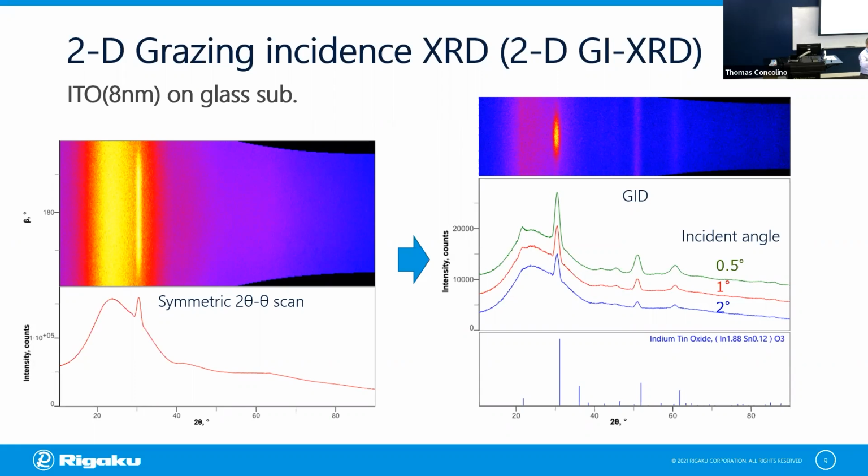Because the 2D detector doesn't have any collimating devices between the sample and the surface, all the X-ray from the sample is hitting the detector surface. If the footprint of the beam is big, the diffracted profile becomes broad as well. So that's why we have to have a very small footprint on the sample surface to get a reasonably sharp diffractogram in the case of a 2D detector.